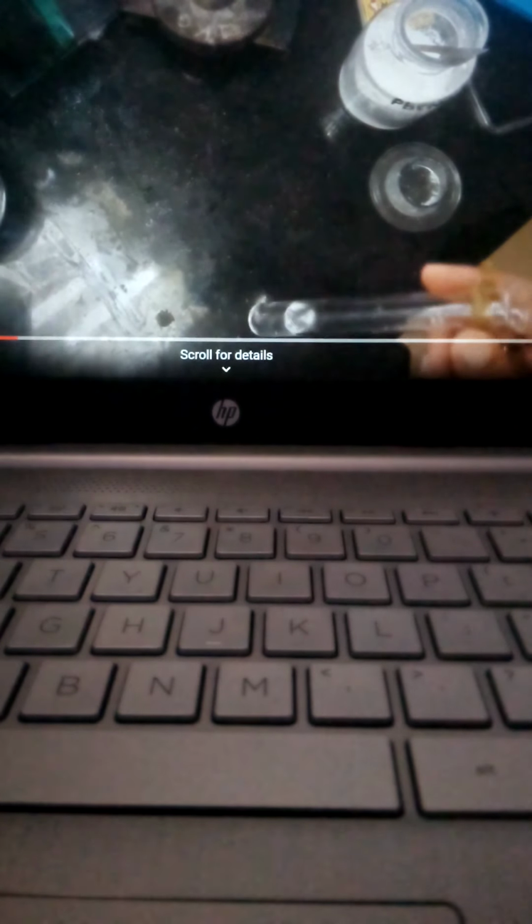So for the determination of first group basic radical, I will use dilute hydrochloric acid as a group reagent. By using a dropper, add small amount of dilute hydrochloric acid. Observe carefully. By using a dropper, add small amount of dilute hydrochloric acid to a original solution.